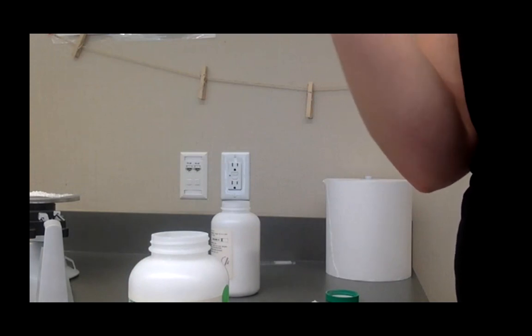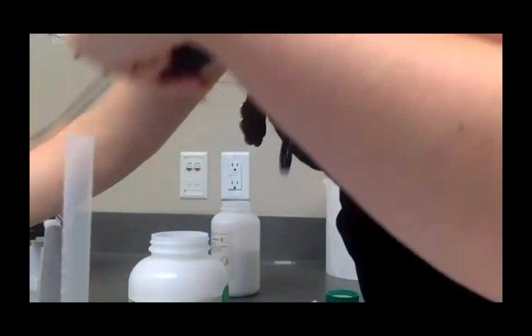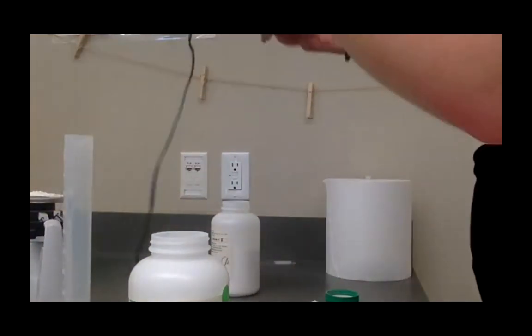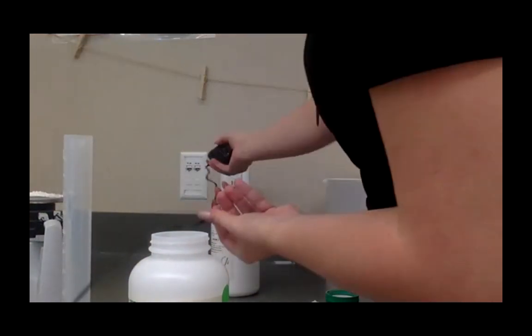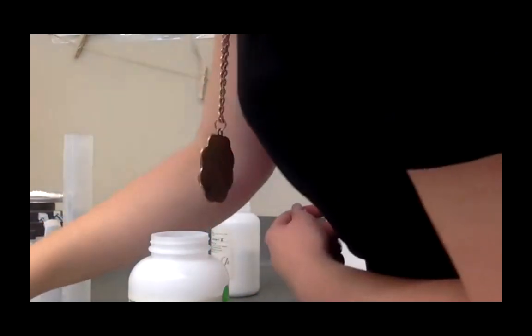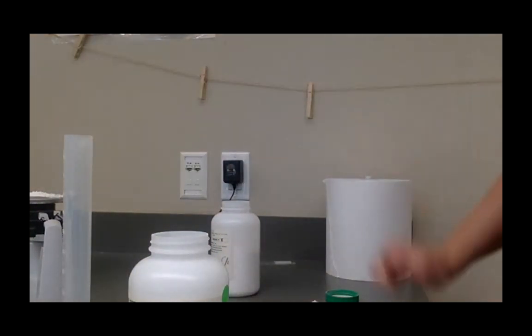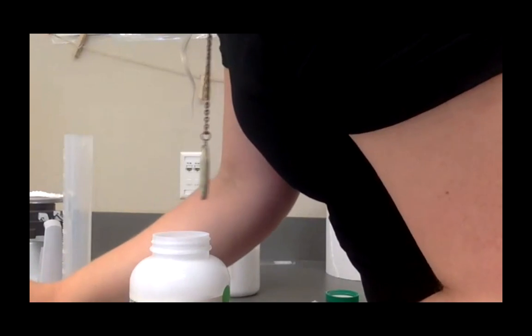You're like, yay, subtracting. Okay, so then here's a glucose for you. If you want to use the digital scale, we'll plug this guy in. It's looking like it's almost exactly 10 grams. Wow, that's amazing. I hope this plug works. Hopefully it does. Oh, it turned on. Oh, good. Okay. So, oh wait, first we want to take this off first because we're going to zero it first.